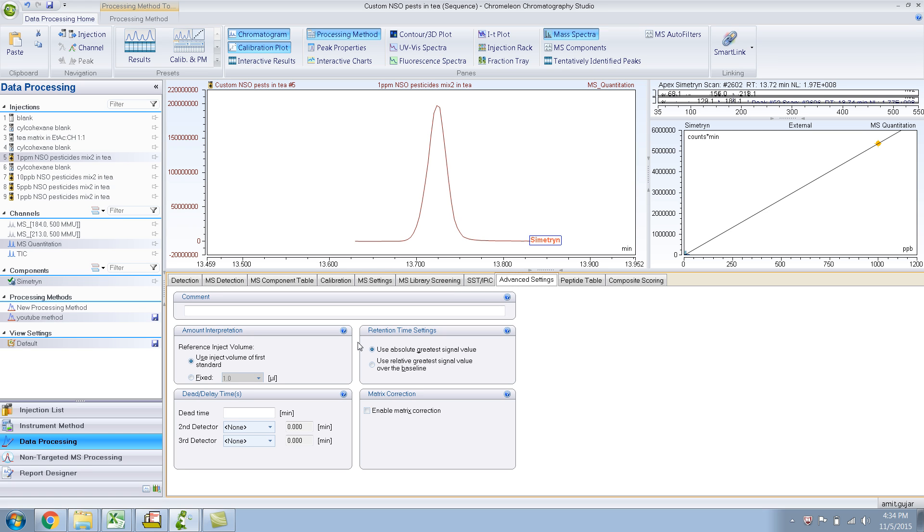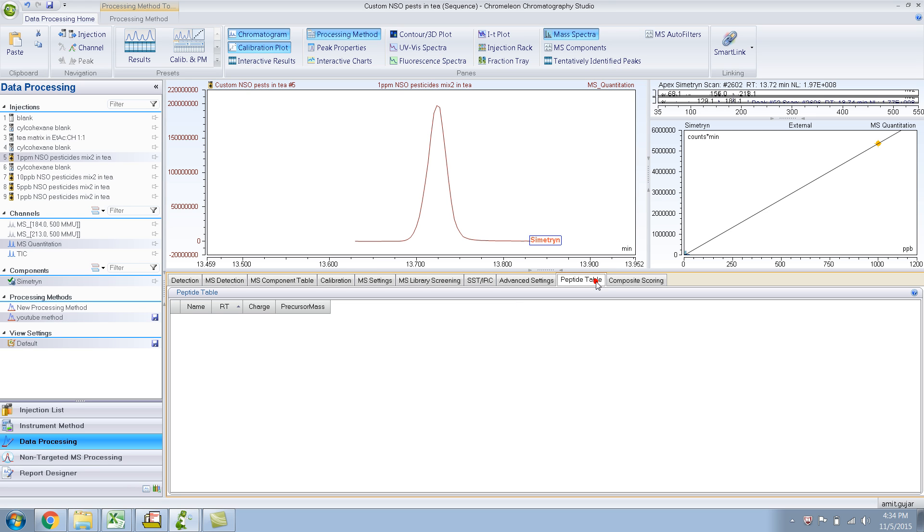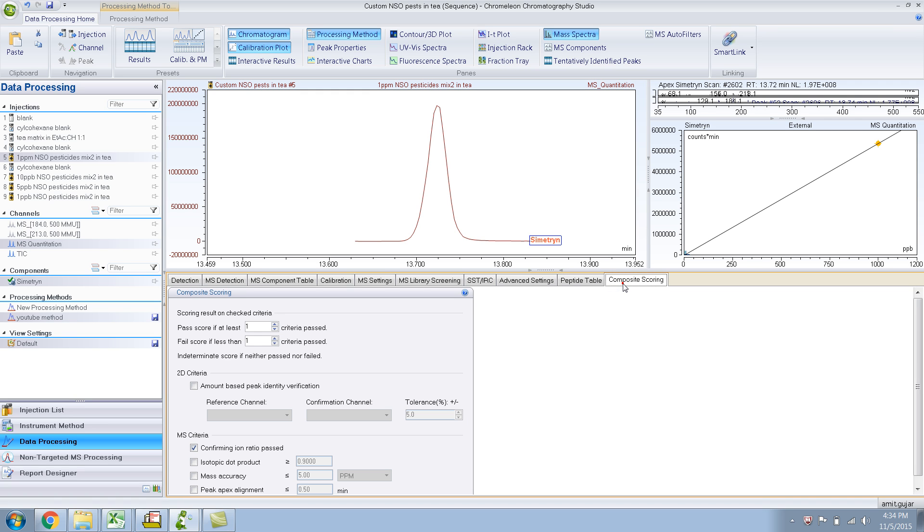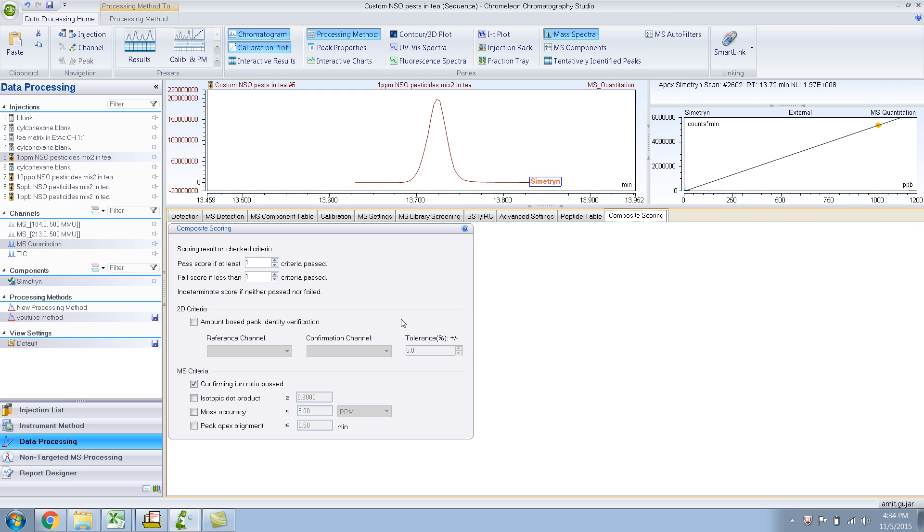Advanced settings. There are some more settings. What can I say? I haven't used any of these. Peptide table, I bet it's not for GC-MS. Composite scoring is basically what qualifies it as a pass.